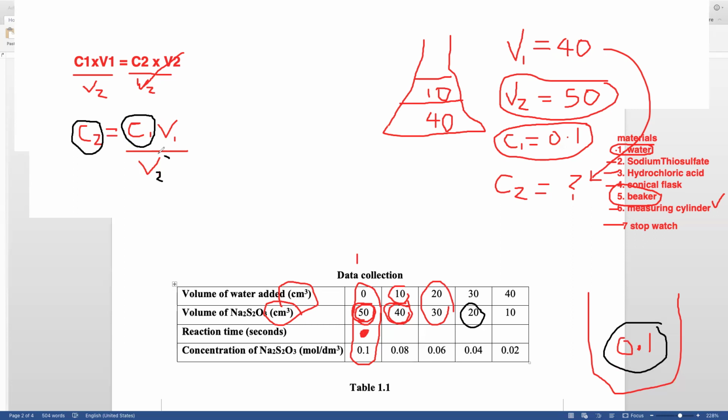So, and across, when we get a small amount of sodium thiosulfate, a big amount of sodium thiosulfate, we are adding water, and all across the final volume is actually 50, meaning the final volume is not changing. Therefore, this formula will be used throughout, and the only substitution we will be making is for the V1, the volume of the aliquot that we are getting from the beaker. So this is the formula that we'll be using to substitute those values.